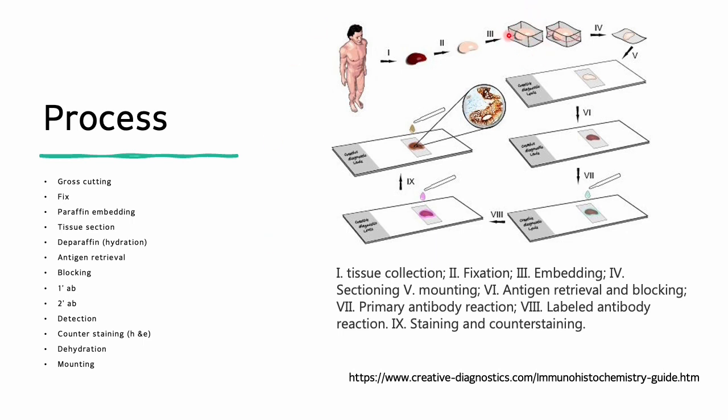Paraffin block is important because with paraffin block you can section this block later, and then you can stain it with your protein of interest later. So in many cases I preserve this tissue with this paraffin block because my protein of interest changes over time.